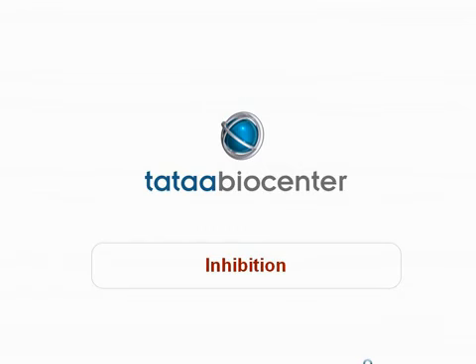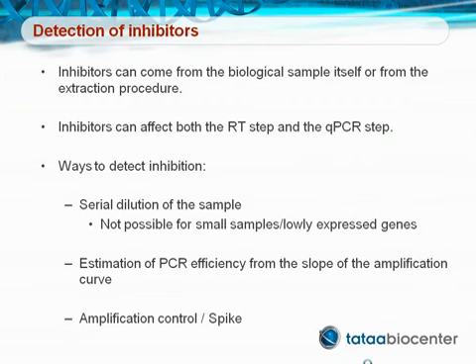Now I will talk more about inhibition and how to test for inhibition. Inhibitors are factors that disturb the enzymatic reactions that we use in our experiments. Inhibitors can come from the biological sample itself or be introduced from the extraction procedure. They can affect both the reverse transcription step and the qPCR step. Sometimes the inhibition is so strong that you will not get any reaction at all. But it can also be that it is just partly inhibiting, lowering the efficiency of the reaction. This can be more difficult to detect, but still it can give you erroneous results if you are not careful.